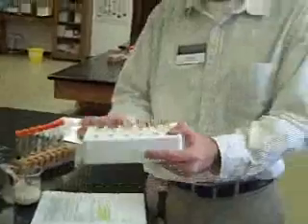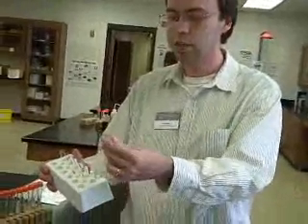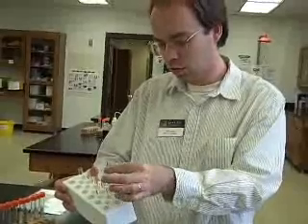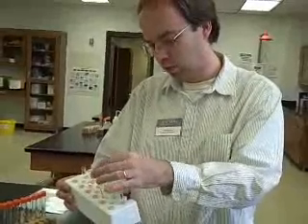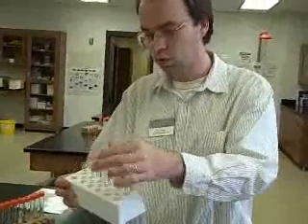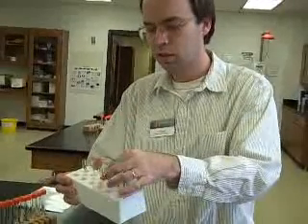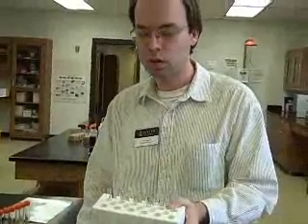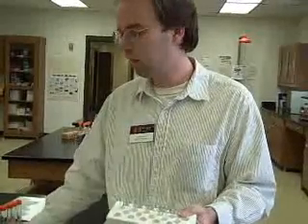So we had different glass test tubes. We had some test tubes of water for our controls, and we had sugars like glucose and fructose and galactose, and sucrose, and maltose, and also lactose. These are all kinds of sugars, with the exception of our controls, the water, and we wanted to see what kind of results we would get if we added the yeast.